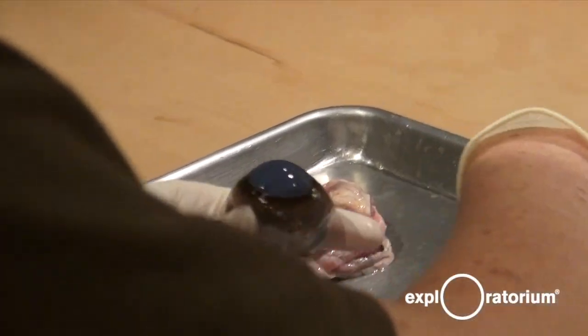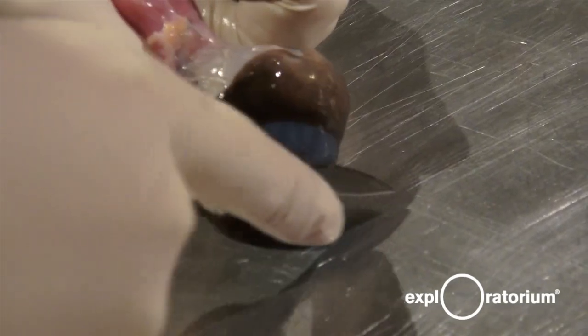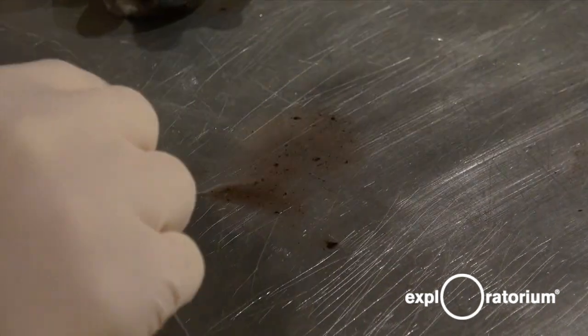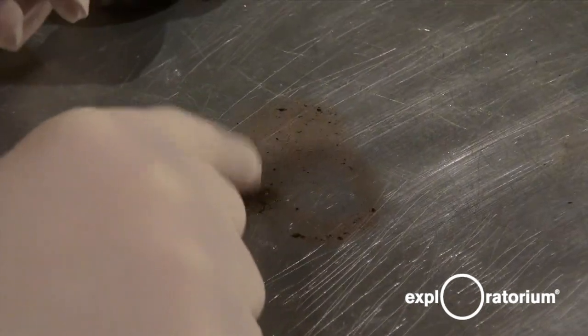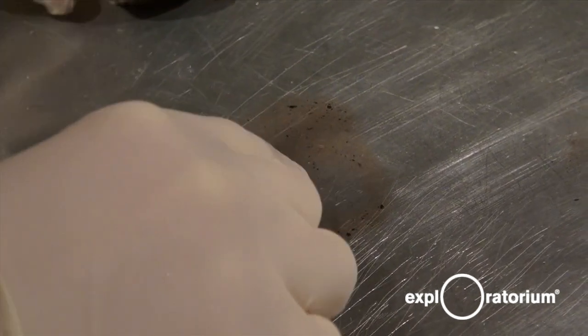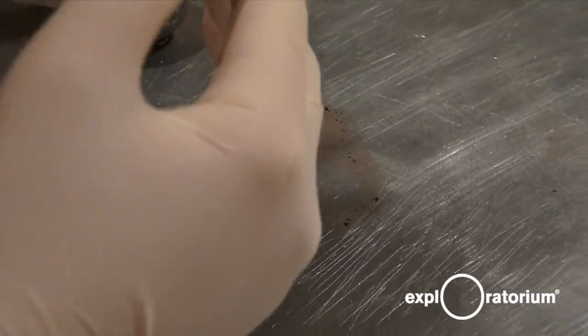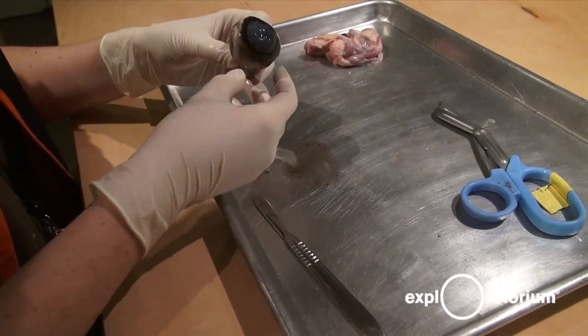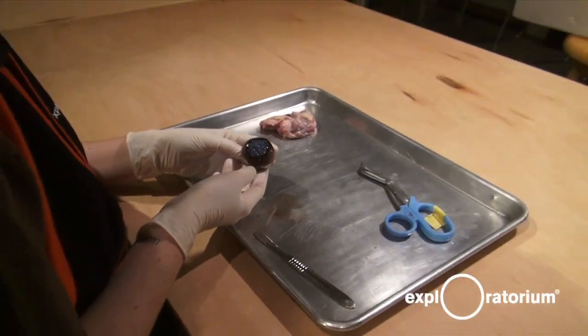Now I'm going to make an incision into the cornea so we can see what's right underneath. It's pretty thick on a cow, thinner on a human, but still a nice protective layer. You can see this cloudy brown fluid — this is called the aqueous humor. It acts like blood for the eye but without being red. Normally it is clear and it nourishes the cornea, brings it oxygen, nutrients, and filters out waste. It also keeps the round shape of the cornea — without that fluid there, the cornea has become deflated and it's not very good for focusing light anymore.